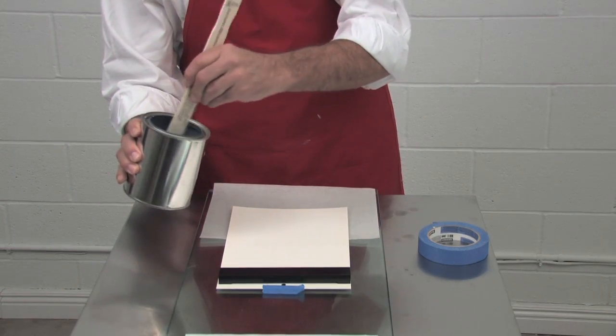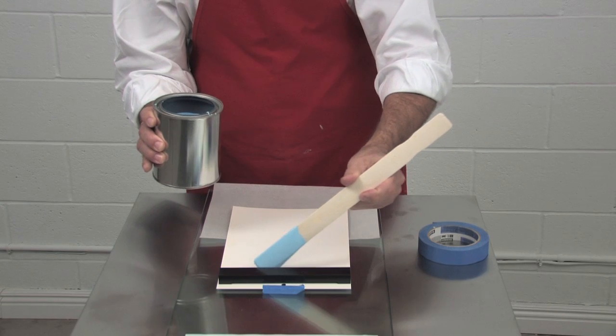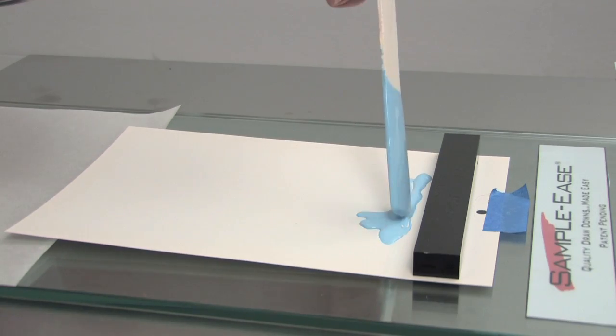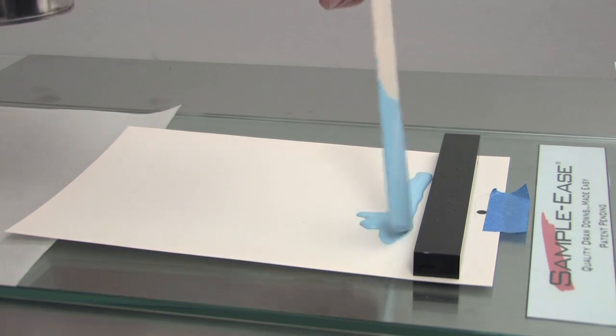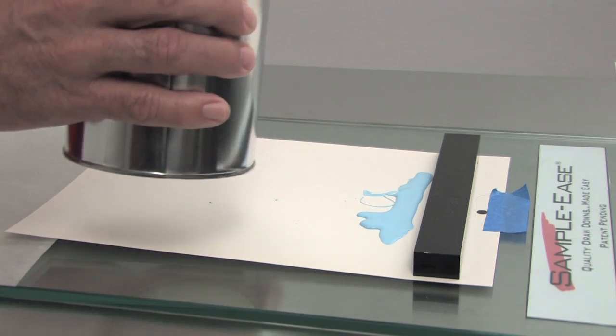Get your paint out of the can onto the card with either a paint paddle or a dipper, and then just pull a line of paint, again in front of that blade, not where your feet are. It might take you a couple dips to do.